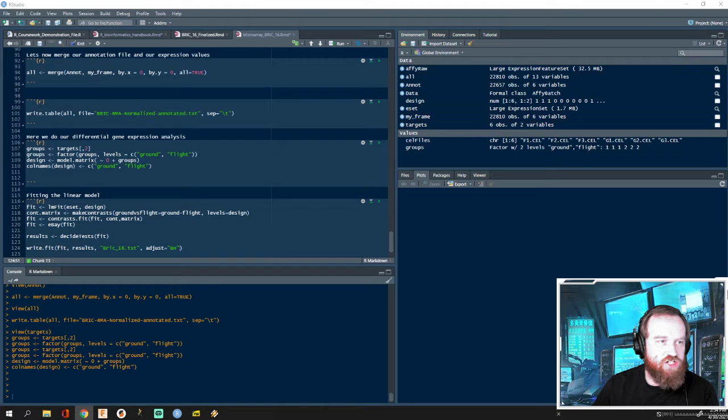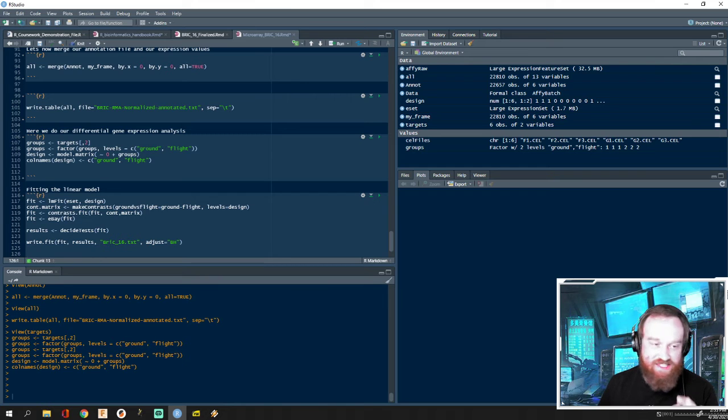I wanted to get this right because I think I've messed up their names before. So this is the adjustment for p-values. The reason we do an adjustment, let me take a step back, is because when you do so many tests, there is a possibility of getting a false positive. So let me pull up a quick example.